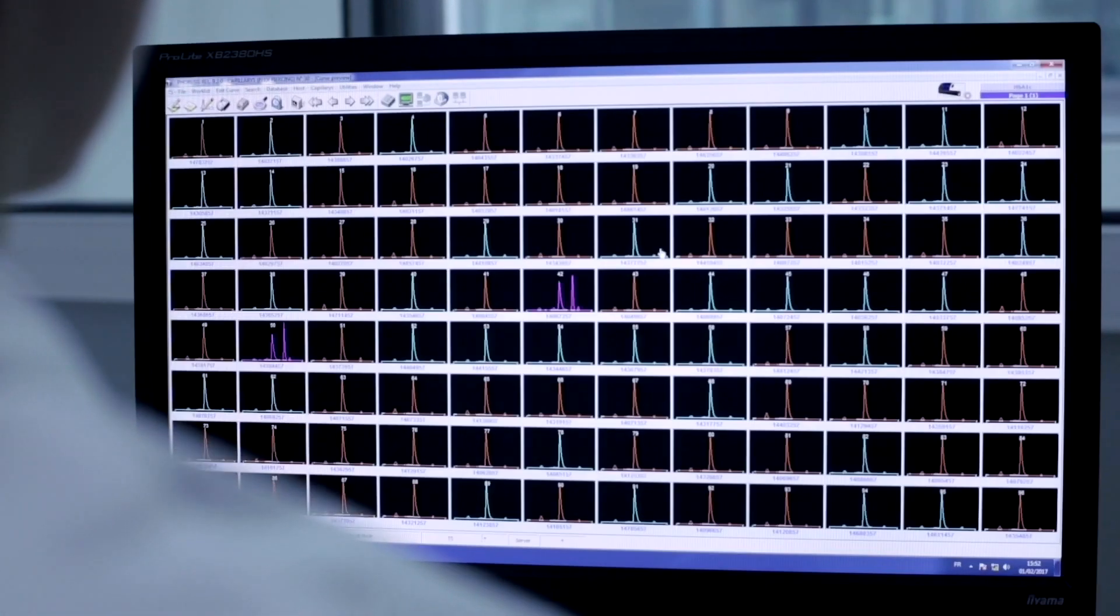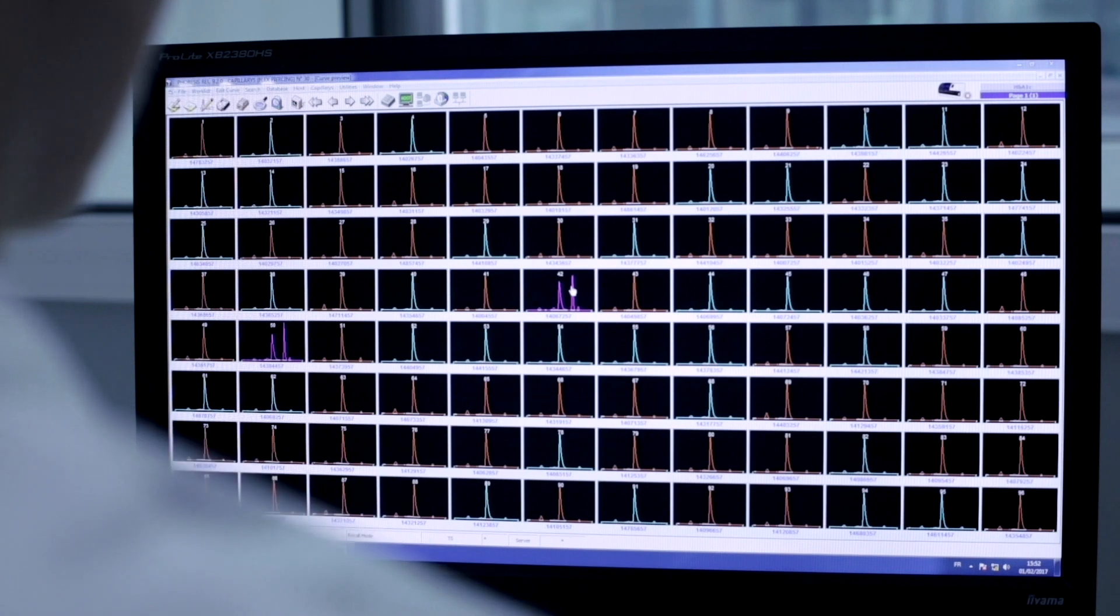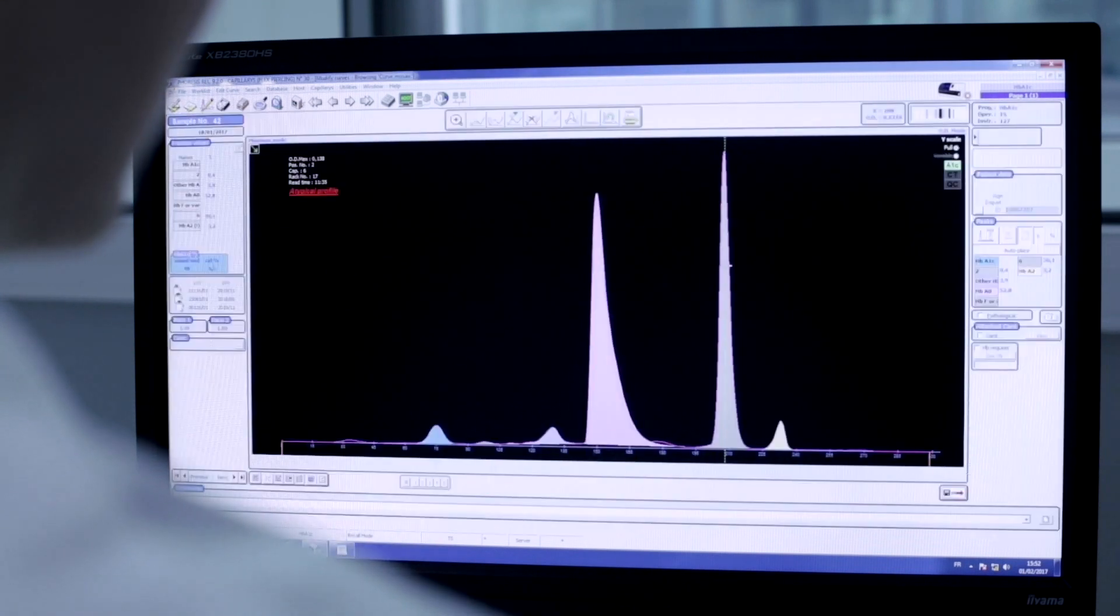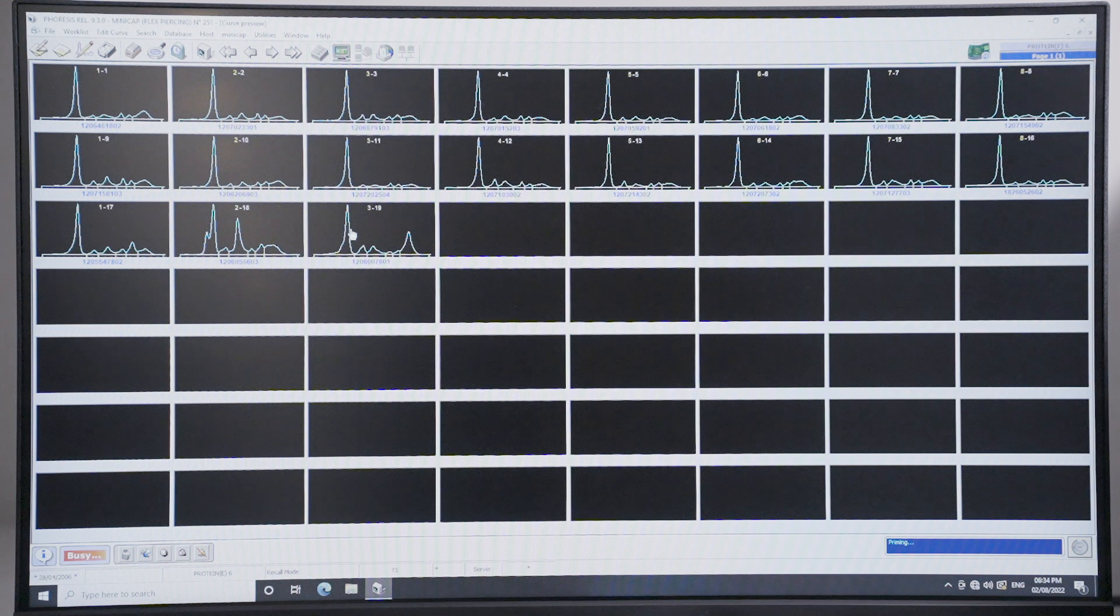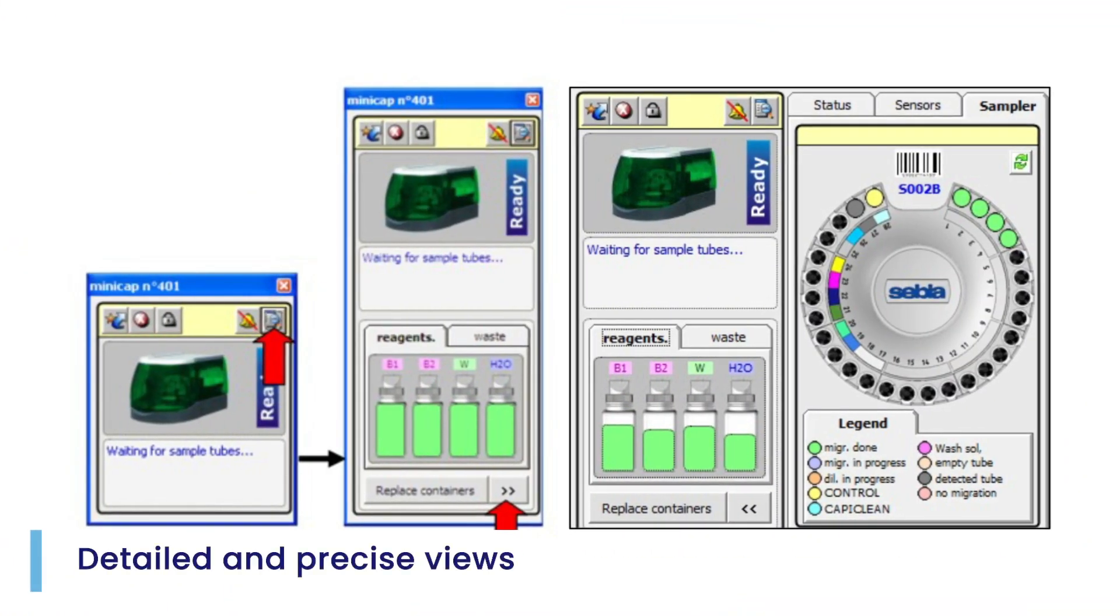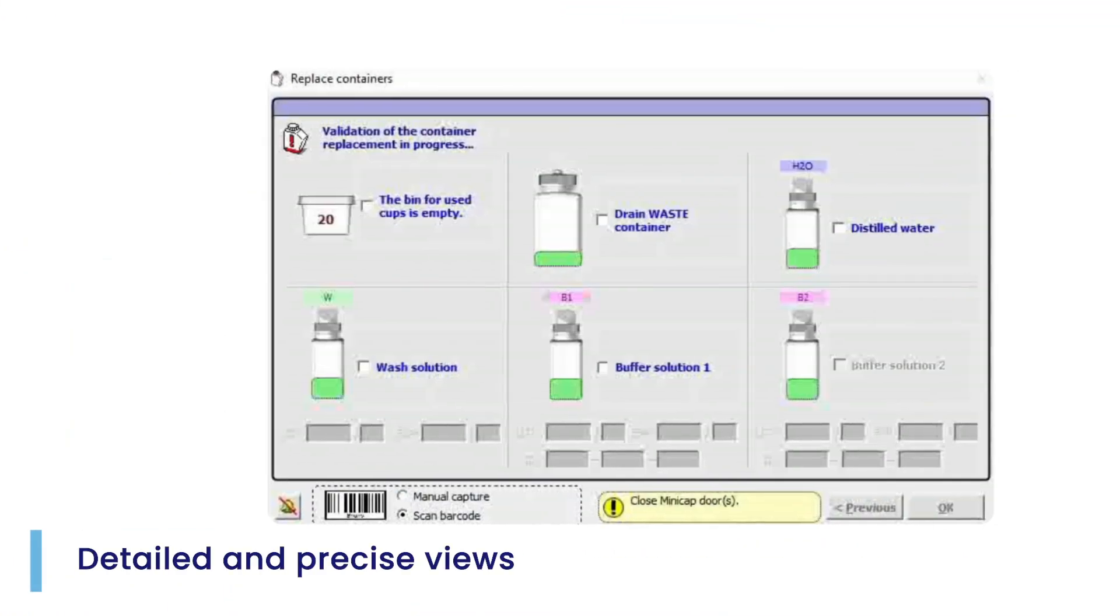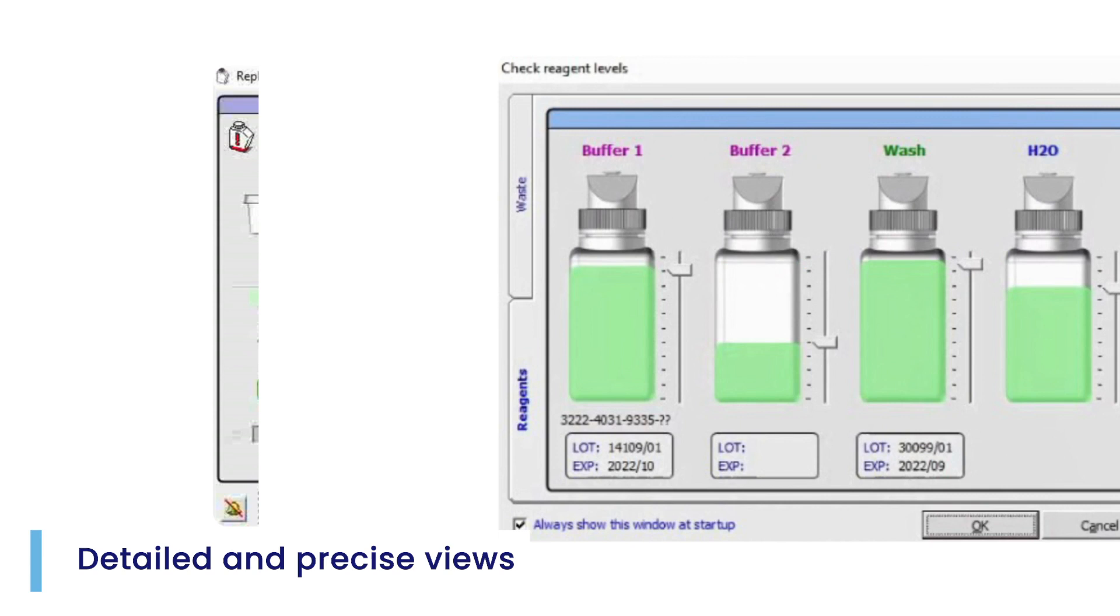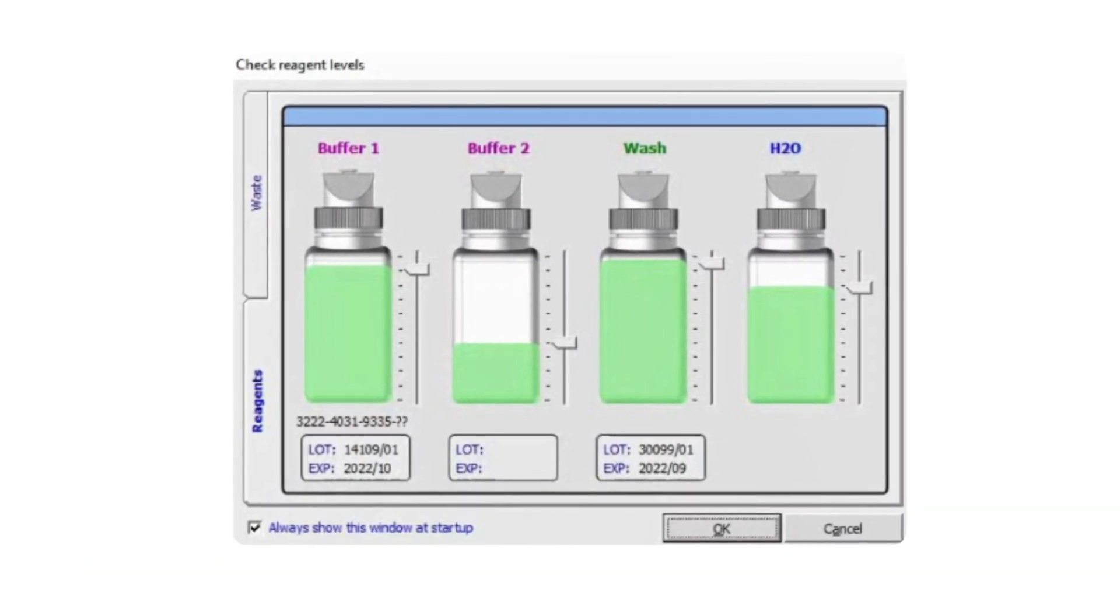The color coded curves on mosaic screen help in sorting of normal and abnormal profiles with advanced alarm system which allows fast validation of results. It provides a detailed view of carousel, reagents and progress of dilution and migration on the computer screen.